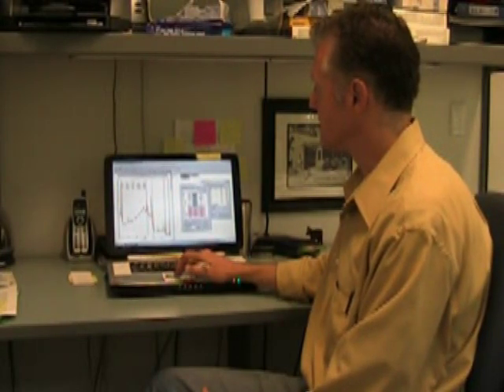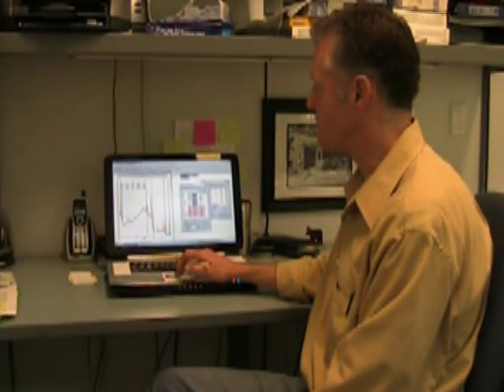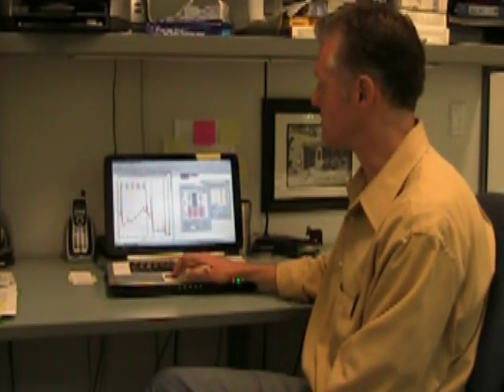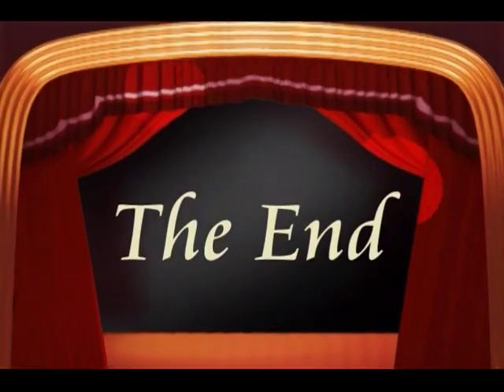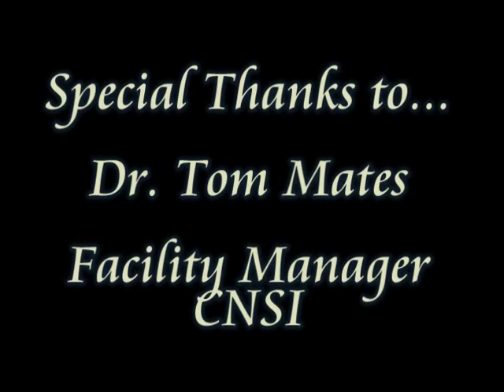So both from the survey and from the oxygen high-resolution and the gallium high-resolution and the nitrogen high-resolution, it all adds up to a story that tells us that what it looks like we have is a gallium nitride surface with about 10% of the galliums at the surface being bonded to oxygen rather than nitrogen, which is typical for a piece of gallium nitride that has been exposed to the atmosphere.